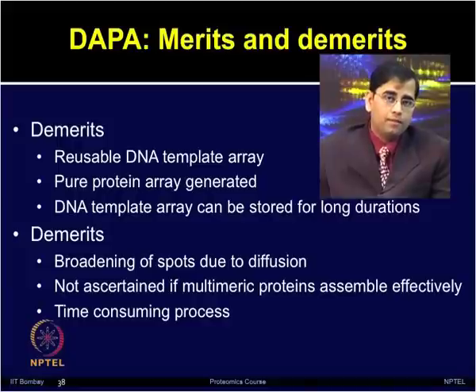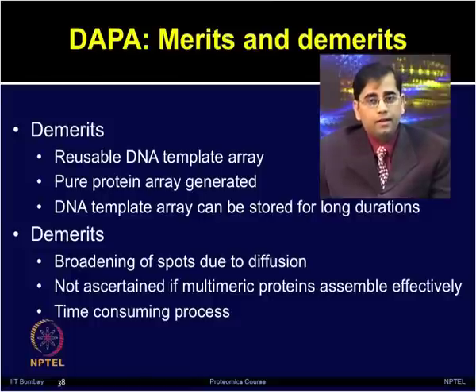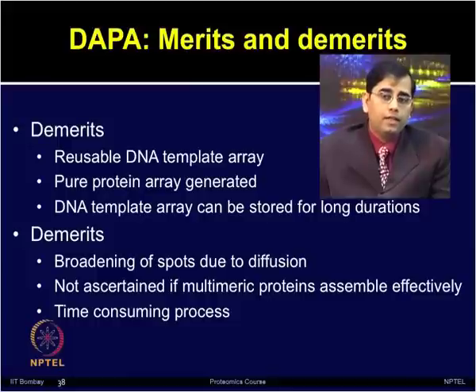However, there are certain limitations of using the DAPA method, including the broadening of spots due to diffusion. It is not ascertained if multimeric proteins assemble effectively. This is also a time consuming process.